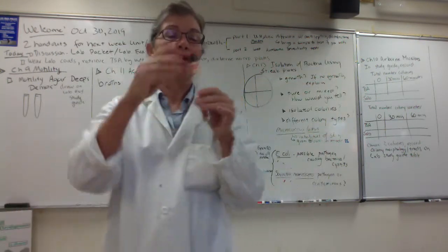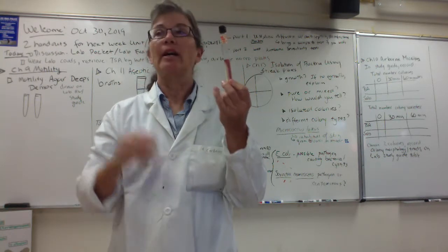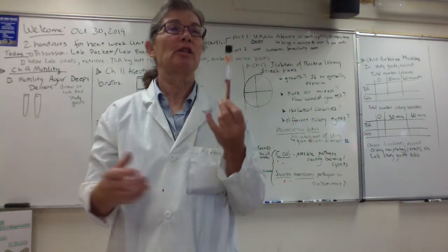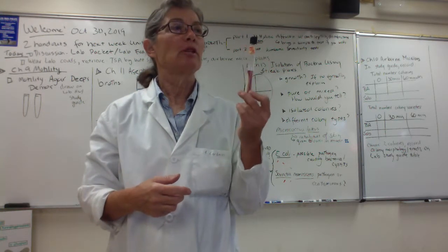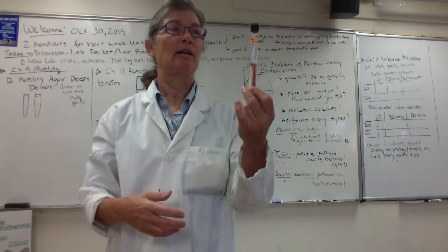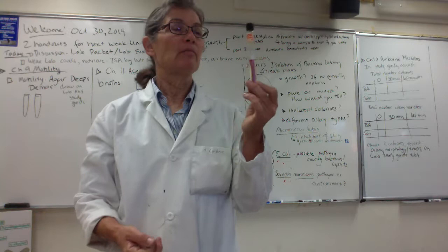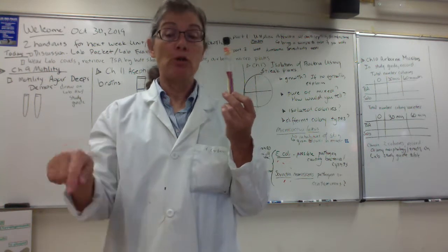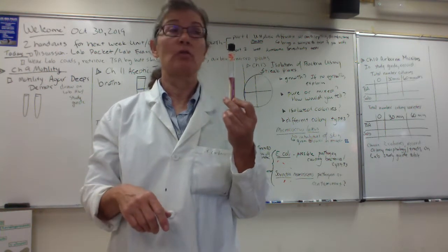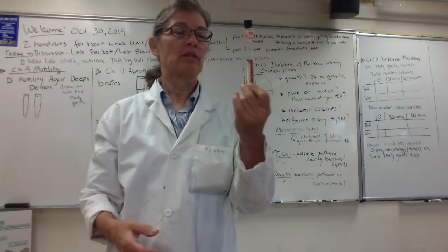This is Proteus mirabilis. This is a cousin of E. coli. And just like E. coli, Proteus is covered with flagella. What's that flagellar arrangement called when the entire surface is covered with flagella? This is what you want to practice for the lab exam. Do you remember those? You can look at your motility handout. That's totally fair. So if the whole surface is covered with flagella, what's that flagellar arrangement?